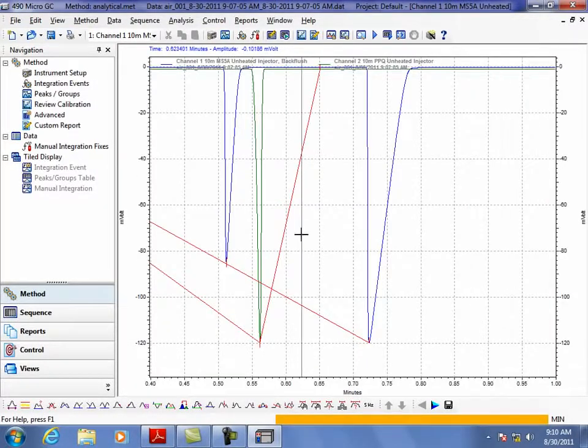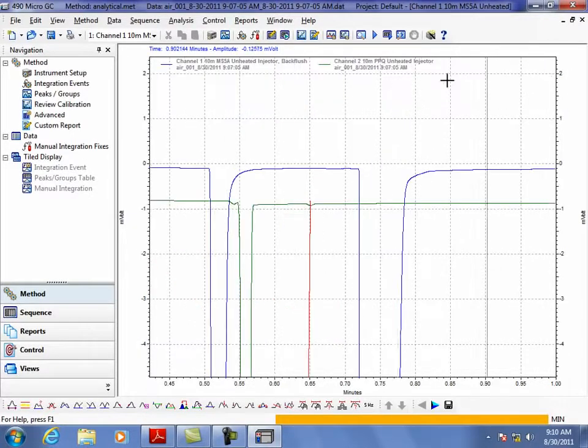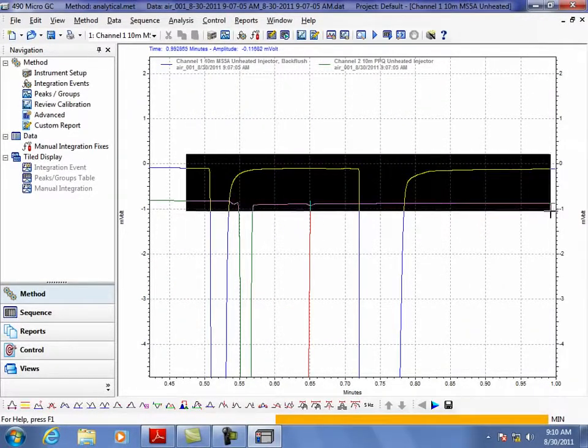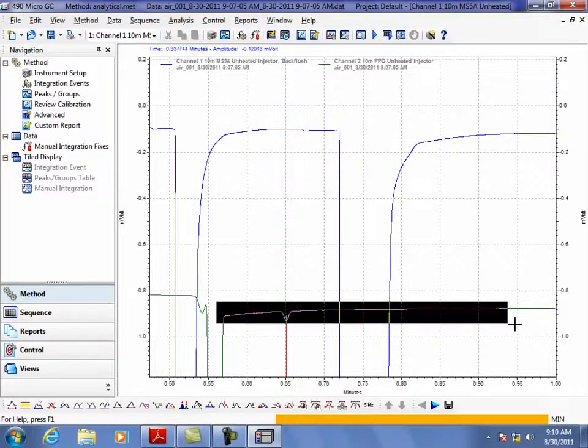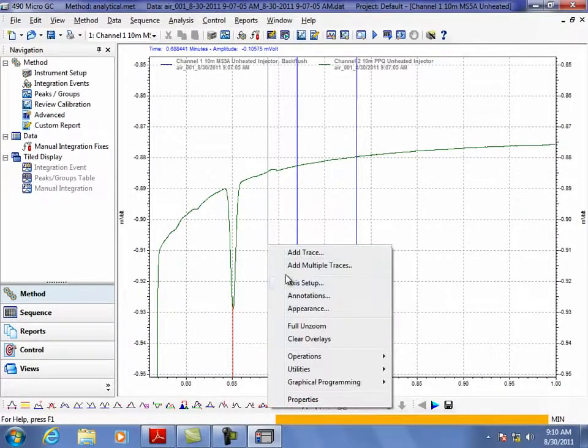The baseline is good. What we're looking at is oxygen and nitrogen on the one, and just a composite air peak on the other. I can blow this up. Don't know why he put both of these on one channel, but if we blow this up, you can even see that this is going to be CO2 at about 400 parts per million. So I know where the CO2 is coming out as well. So let's get that fixed, and otherwise I don't want to run any more samples. Sure. Okay.